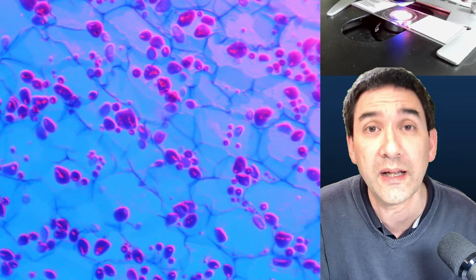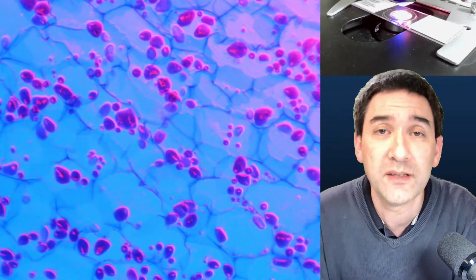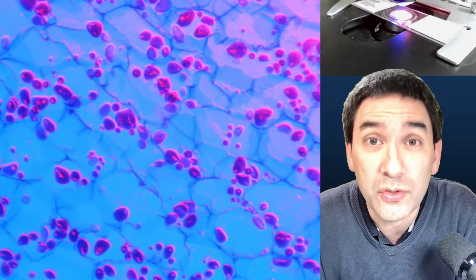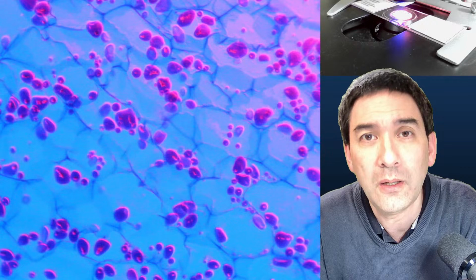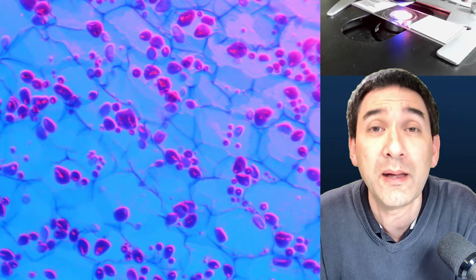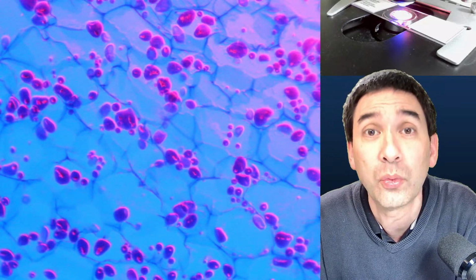The short answer is yes, maybe. I can say that because I tried several years ago. It depends on the material that you use. A couple of years ago I tried using homemade filters in my microscope with a halogen lamp, and I felt that the filters got quite hot.